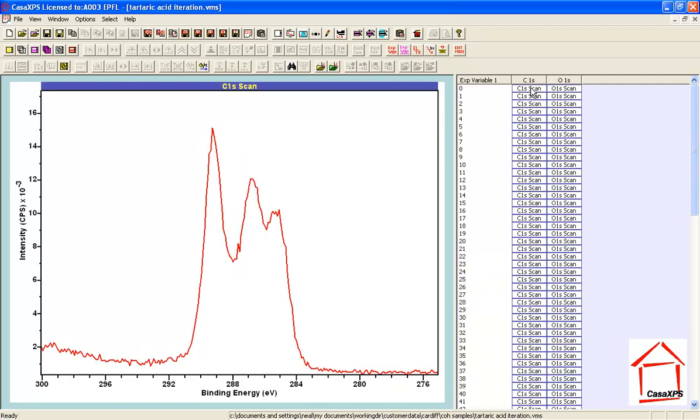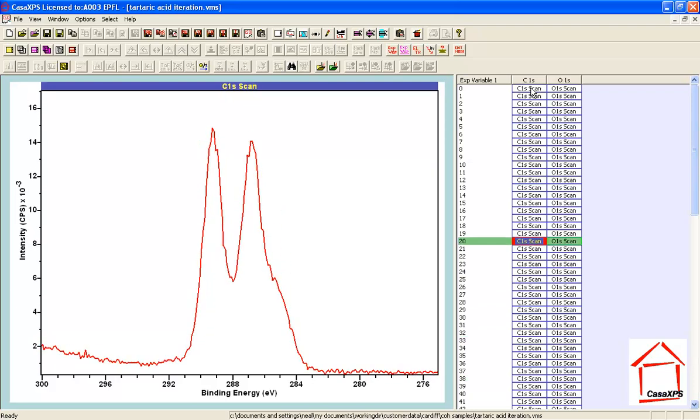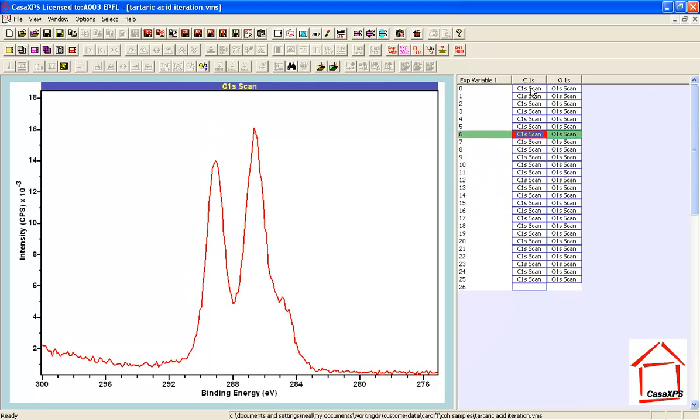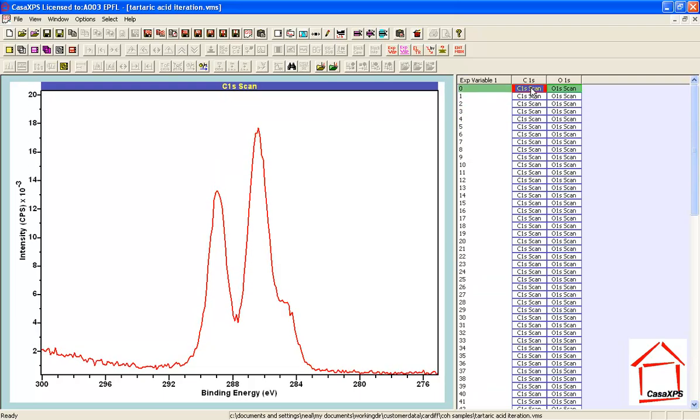And as we go down this list, you can see after a while that there is clear evidence that the material does change. So XPS alone is capable of altering the chemistry of tartaric acid. It's also possible any other sample preparation may similarly damage the sample, and what we see here could be just a natural consequence of when we try to prepare a sample for analysis, we don't see the pure tartaric acid simply because we've done something that has changed the original chemistry unintentionally.